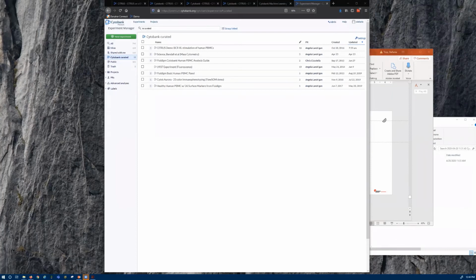Can Citrus be used for non-FACS or non-CyTOF data, even when that data are not necessarily all numerical values, or numerical values that do not have the same scale or range? Unfortunately, Citrus cannot be run with non-numerical data. So if you have, for example, single cell RNA-seq data or single cell data set, and the data are all numerical values.